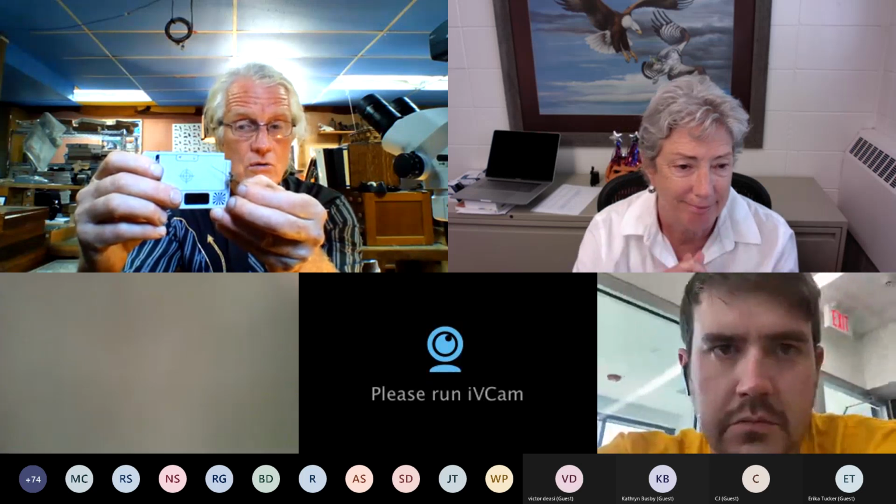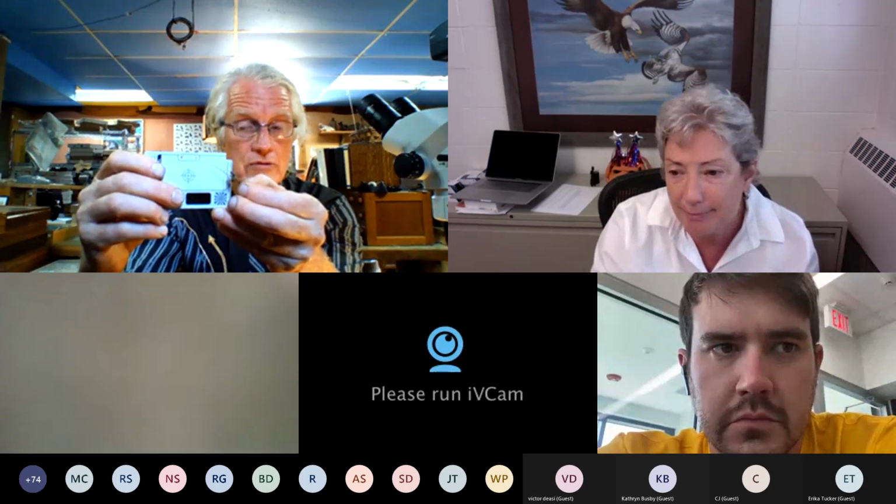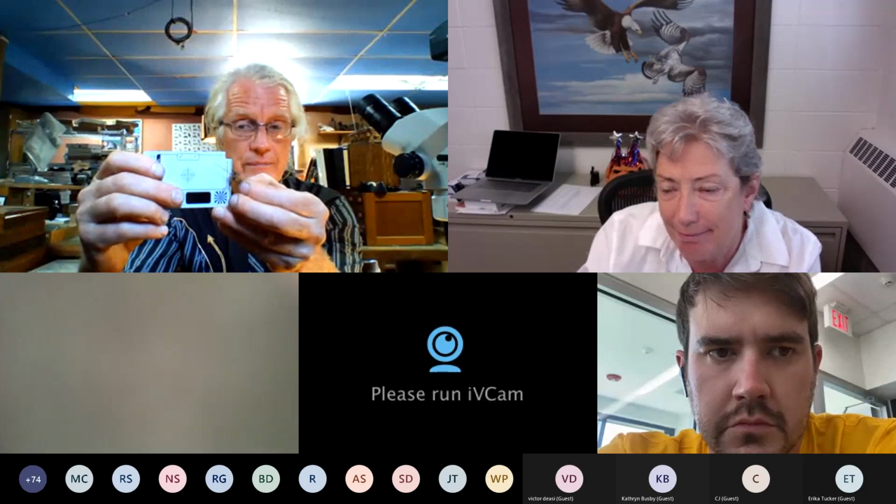Again, we don't care about the absolutes, we care about getting the right answer. So we're going to purposefully overscore, we would call it, specimens. Is that making sense? Did I explain that okay? Let us know in the chat, or everybody can unmute if that is.